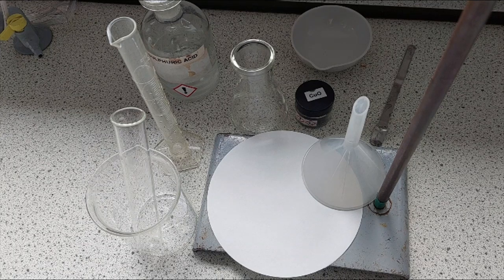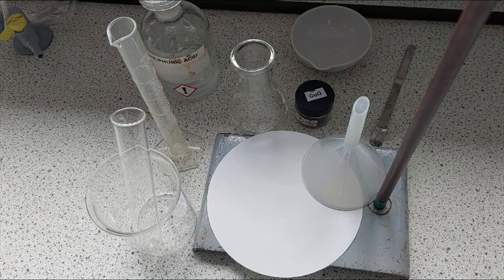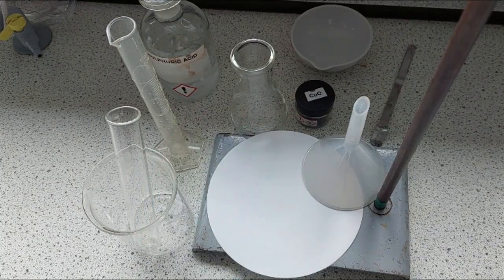Firstly, filtration, it works by separating an insoluble substance from a liquid. So we've got some copper oxide here. Now that is insoluble, doesn't dissolve in water. And we're going to be reacting that copper oxide with sulfuric acid. Sulfuric acid will react with the copper oxide to form copper sulfate. And then we'll filter out any excess copper oxide so that we have a nice clear copper sulfate solution. Once we've got that solution, we will then use evaporation to crystallize the copper sulfate.